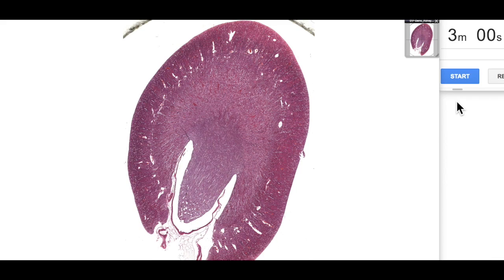G'day and welcome to another episode of 3 Minute Histology with Jamie Chapman. Today we're going to have a look at the finer detail of the structure of the kidney. This is the kidney here.